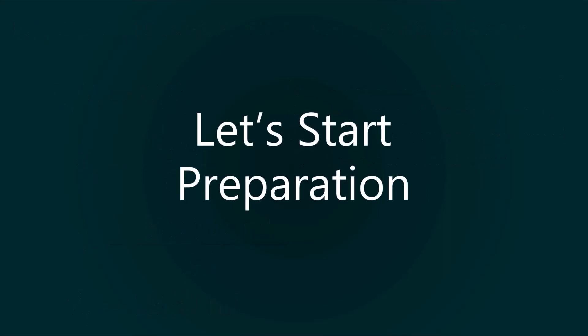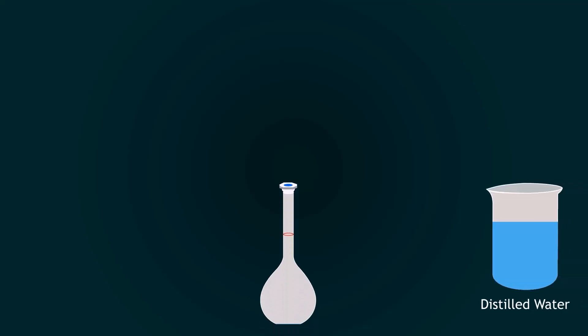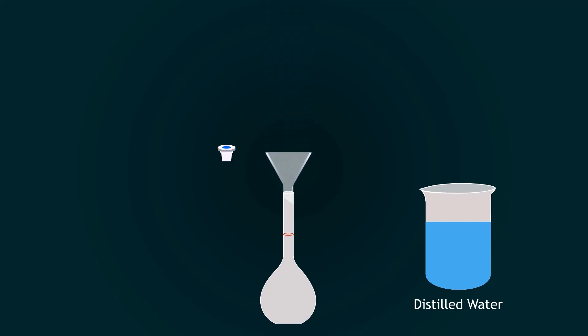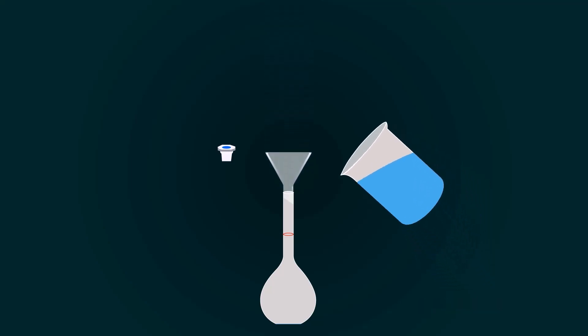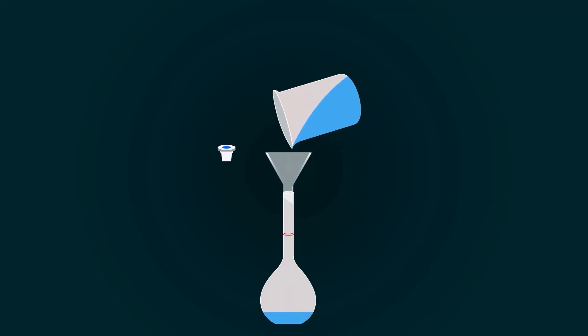Let's start preparation. First of all, take a 500 ml volumetric flask and add some distilled water into it with the help of a funnel. Please avoid adding sulfuric acid directly into the flask, because it may harm you or the flask.